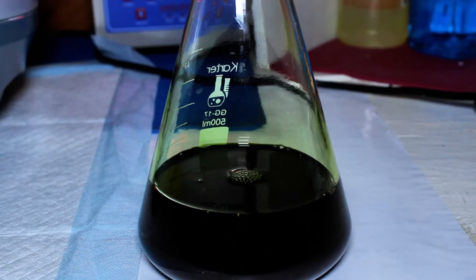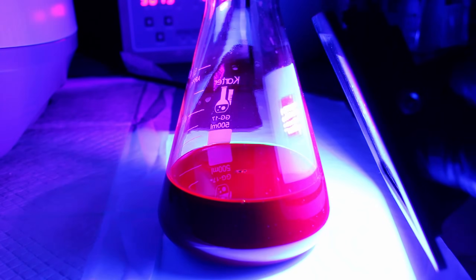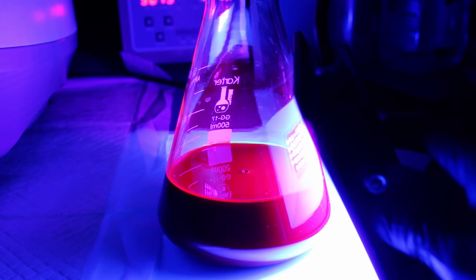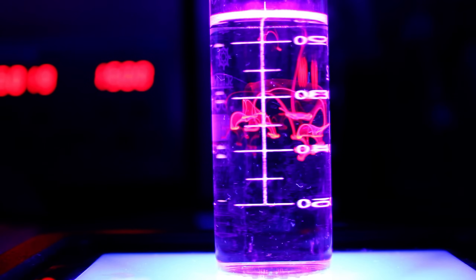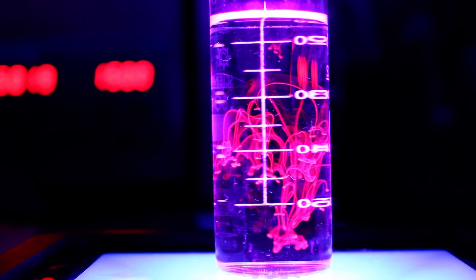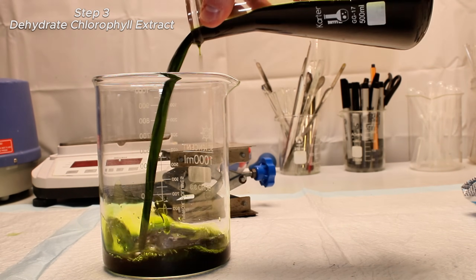Once this was done, I took my crude chlorophyll extract and decided to shine some UV light through it. I've heard for years that chlorophyll fluoresces red under UV light, and as you can see here, that is 100% true. I'll come back to this later in the video, but for now I wanted to dry off the isopropyl along with any water that might have been extracted to isolate my crude chlorophyll.